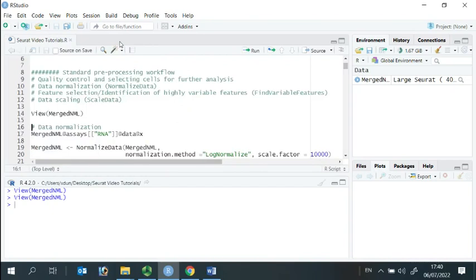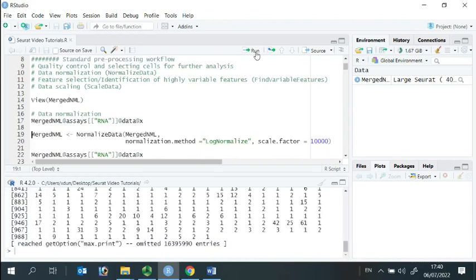We can have a look at the data before normalization. You can see they are UMI counts.